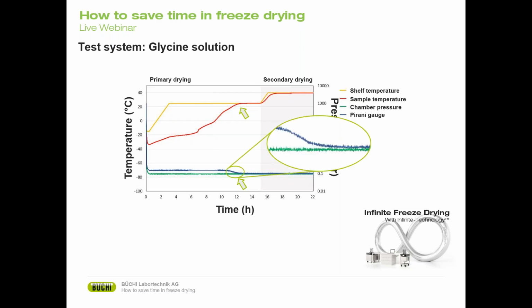However, when we zoom in, we see there's a lot of fluctuations happening. Also, the two manometers in this case do not merge perfectly. Therefore, when we set this difference to 0, we risk that our endpoint will never be reached due to those fluctuations. So I had a look at the fluctuations once the Pirani gauge stabilized again.